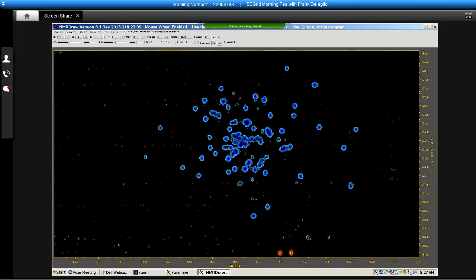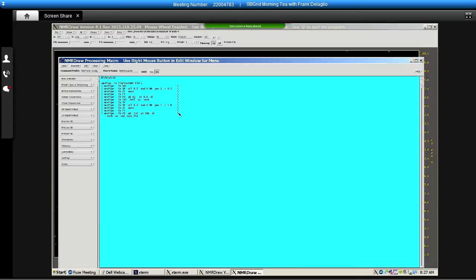So as an example, let's go back to our processing scheme and add some steps to perform baseline correction, which we will do after all the spectral processing is done. And so I'm going to add an additional NMRPipe function here to transpose the data back to the directly detected dimension. And then I'll add an automated baseline correction in that dimension. And I'll save the result.